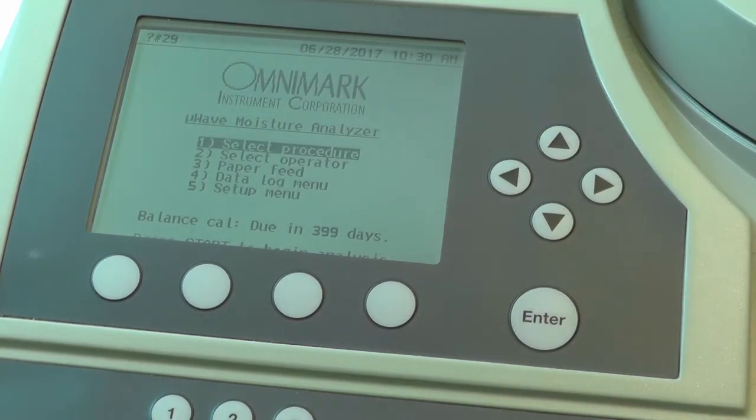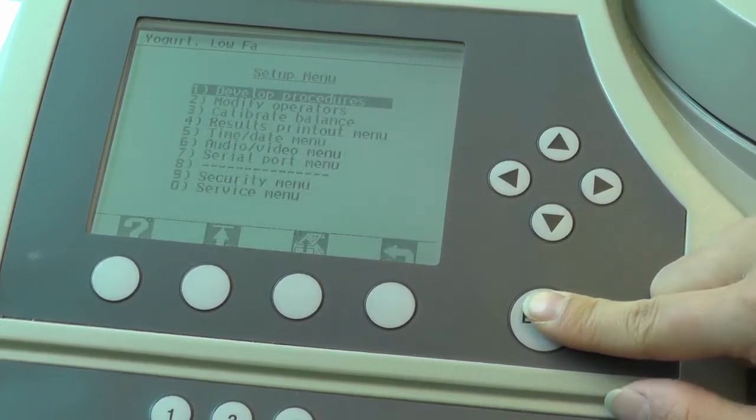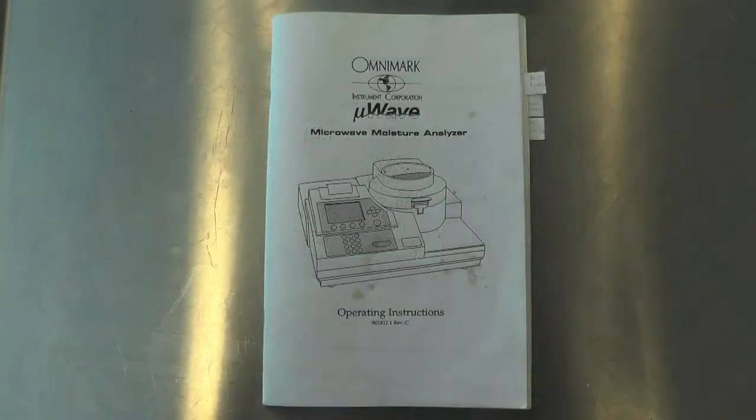If an appropriate preset program does not exist for your sample, press the back key and navigate to the setup menu to add or modify procedures. Please refer to pages 11 to 14 in the operating instruction manual for details regarding how to setup or modify a sample procedure.